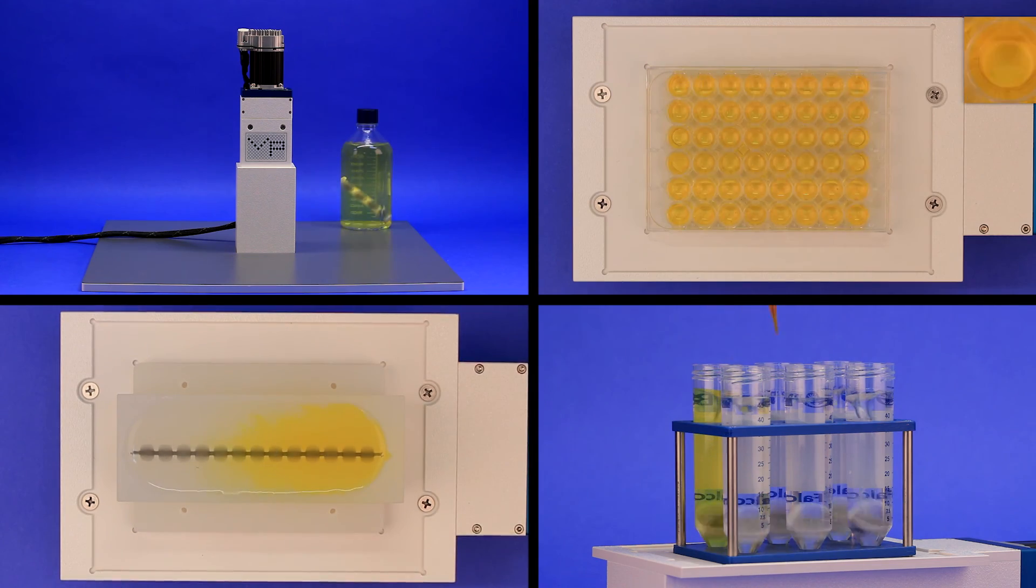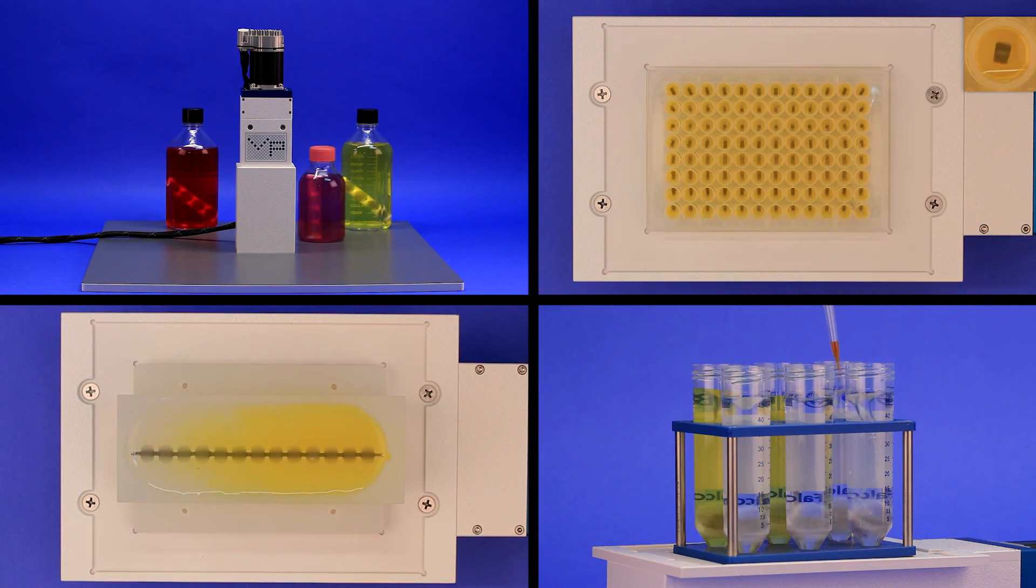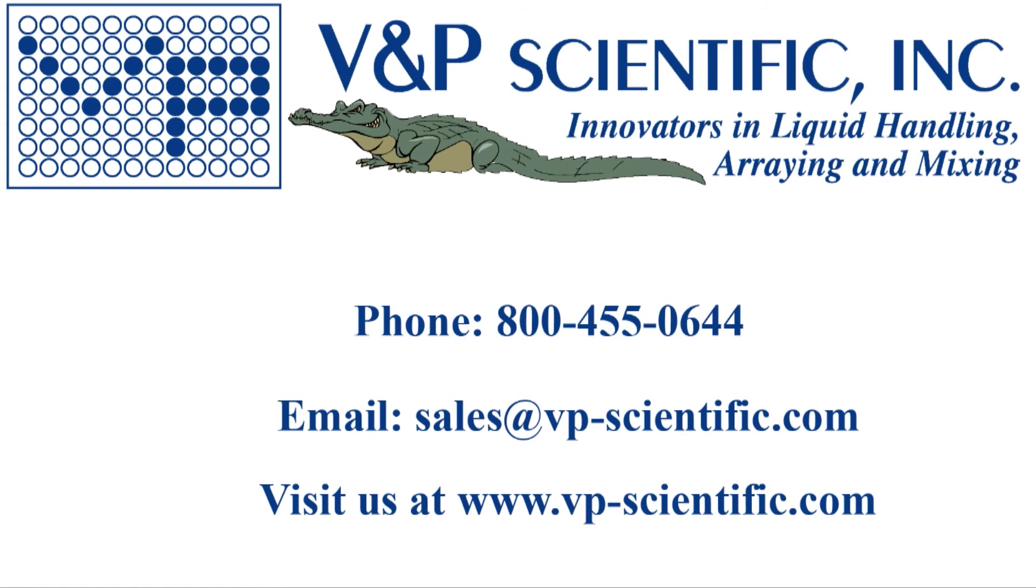The VP710C5 is a versatile, powerful stirrer that every lab could use. Contact us for more information on the products you have seen in this video.